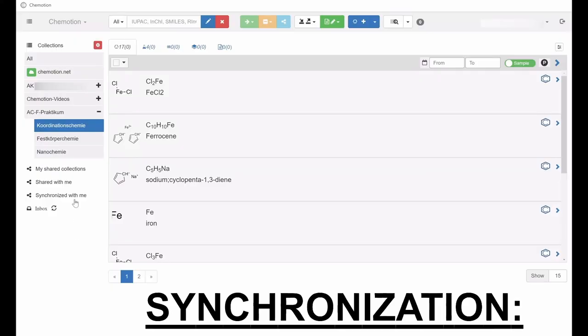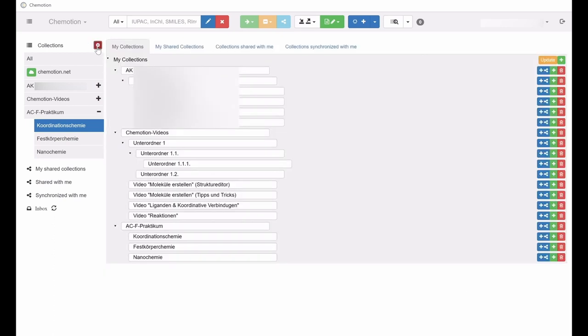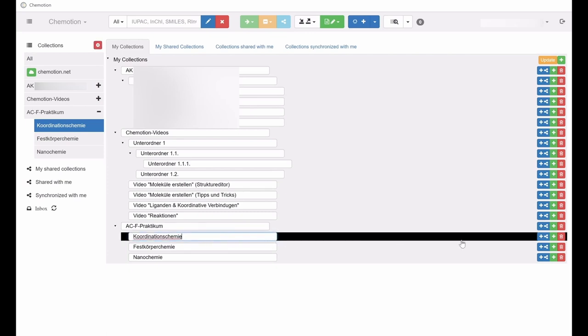To synchronize content, first open the configuration menu of the collection by clicking on the red gear icon. Then, select the blue sharing symbol next to the collection you intend to synchronize.